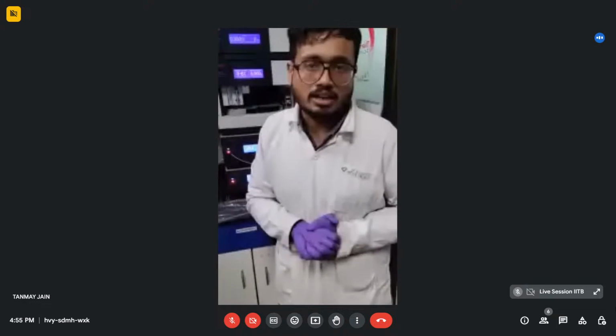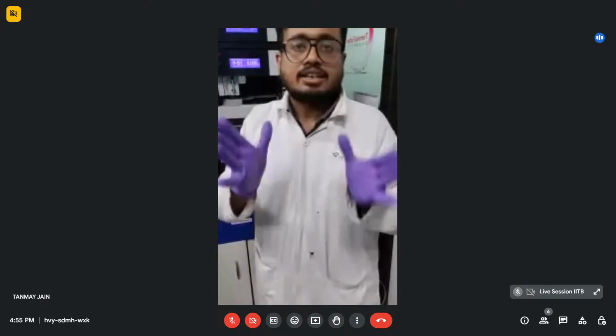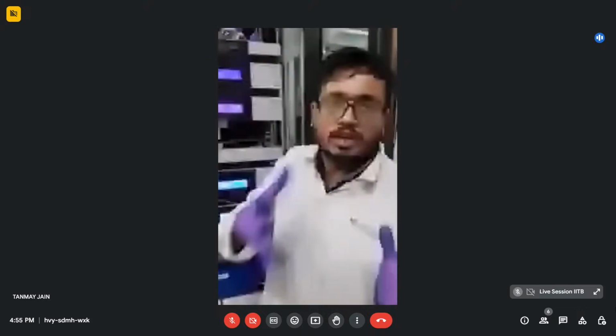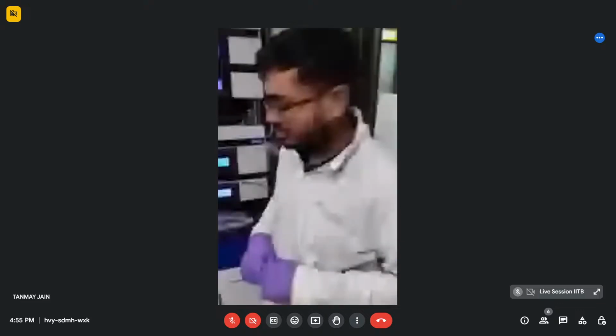They get detected in the detector, and once detected, on the basis of the m/z and the MS/MS we understand what the metabolites are, and you can also see that there is an intensity. So with that, we also want to quantify the metabolites present in the sample and see the differential expression of metabolites. Thank you.